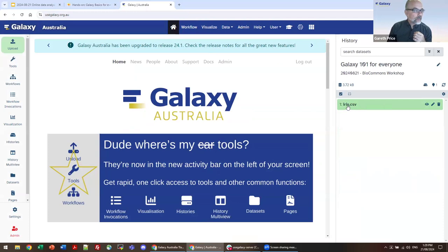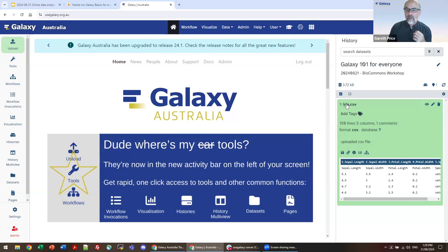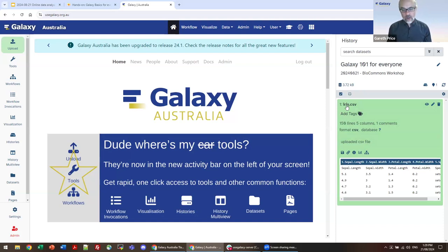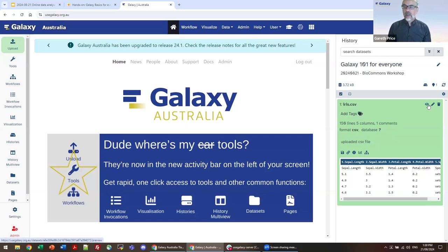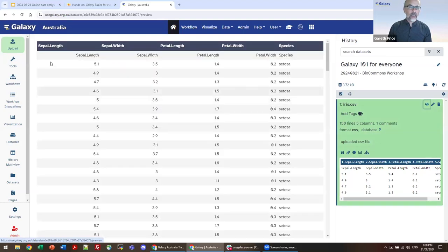Galaxy has stripped the URL address from the file name — we've landed at just the file name but we still have the file type. When you click on the file name or history item, it brings up something called a data peek. I cannot emphasize just how valuable the data peek is within Galaxy. A good majority of tool failures I see are from users not inspecting their data and confirming it's an appropriate data set for the action they want to perform.